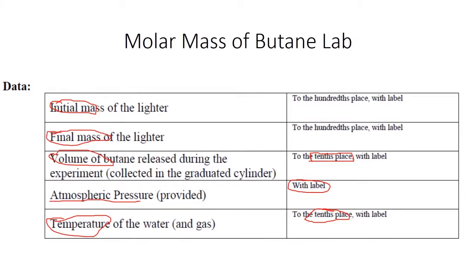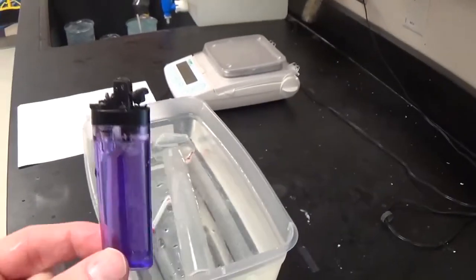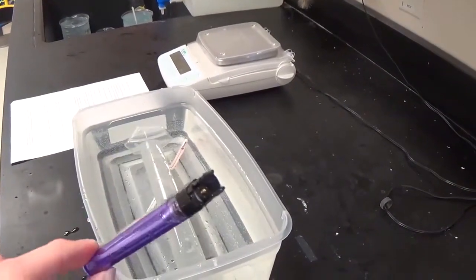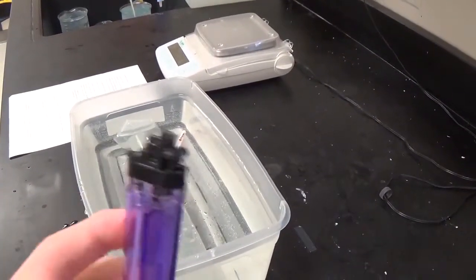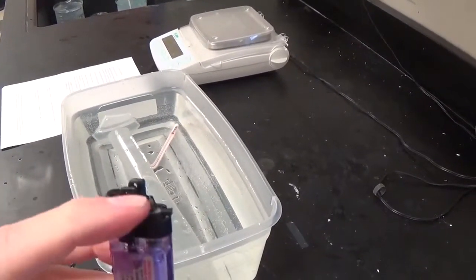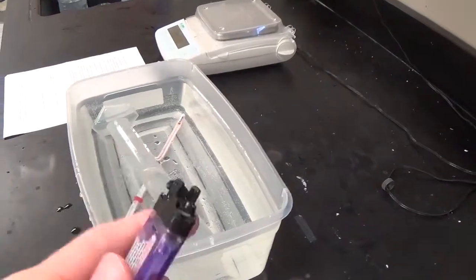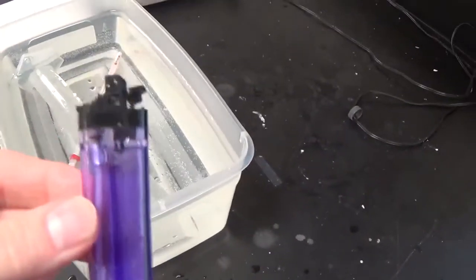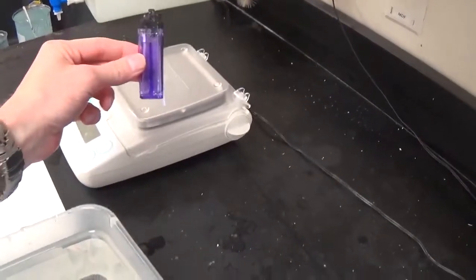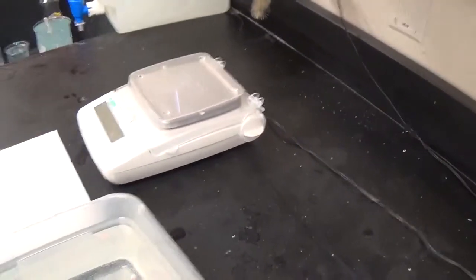Now you need to get the final mass of the lighter. In order to do that, you need to make sure that the lighter is dry. So give it a little shake to get the water drops off. Dry it with a paper towel. Blow on it. Check all the little cracks. Blow in there to make sure that there are no drops hiding. Because we don't want any mass of water. We want the mass of just the lighter. So that we can subtract and get the amount of butane that came out of it.